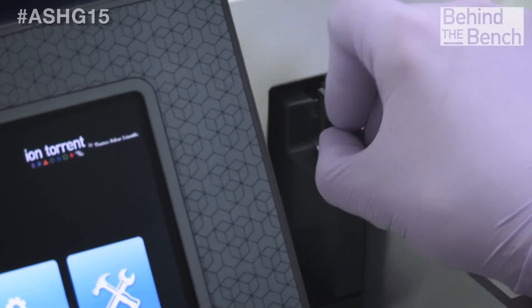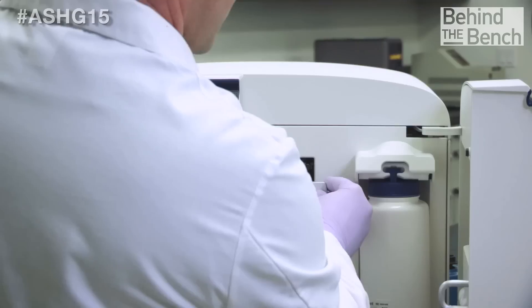And the speed — something Ion has always been really good at — you can do on our smallest chip, the 520, a sequencing run in three and a half hours, with variants being called. The 5 actually comes from our 5-series chips, which is what we're offering with the instrument: our 520, our 530, and our 540.